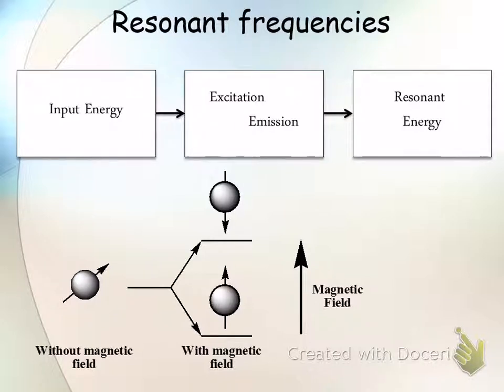We never see this in a compass unless you take the compass and you go like this, crazy, and then you look at it, and it'll be pointing in the wrong direction, and slowly it'll come back to the low energy state. Turns out that's what these guys will do. You start them mostly in the low energy state. You take that energy from the hammer, and the hammer is just an electromagnetic pulse. If you made it big enough, you could disable all the electronics in the building. It's called an EMP, but it's a really small electromagnetic pulse.